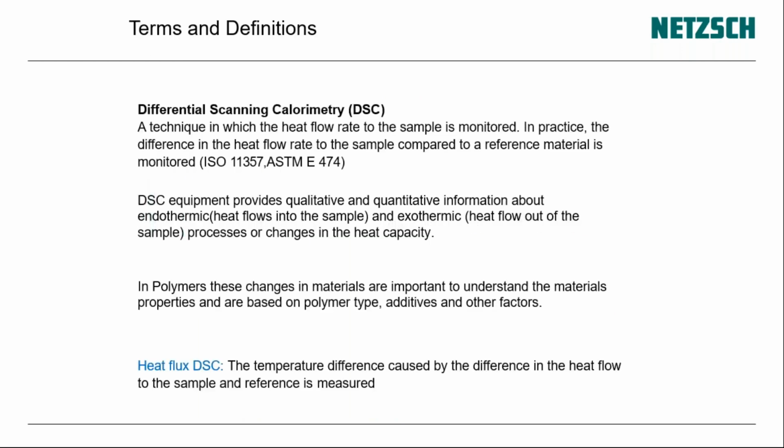So measuring principle. So what is DSC? DSC is a recognized method. It's an international standard method as per ISO and ASTM, as you can see here, ISO 11357 and ASTM 474. So what does this technique do?